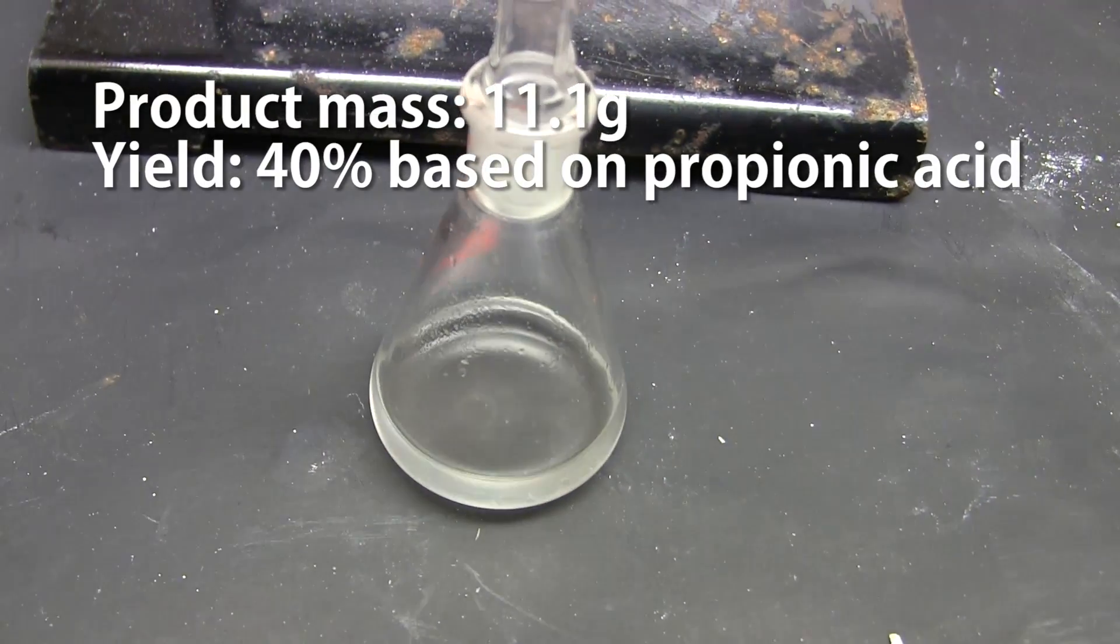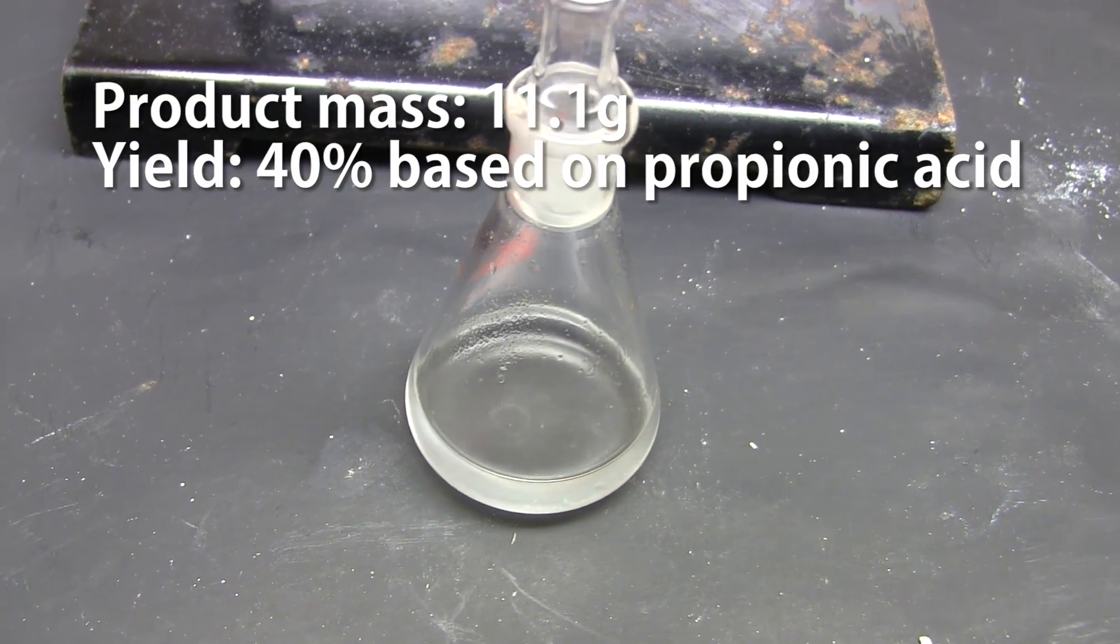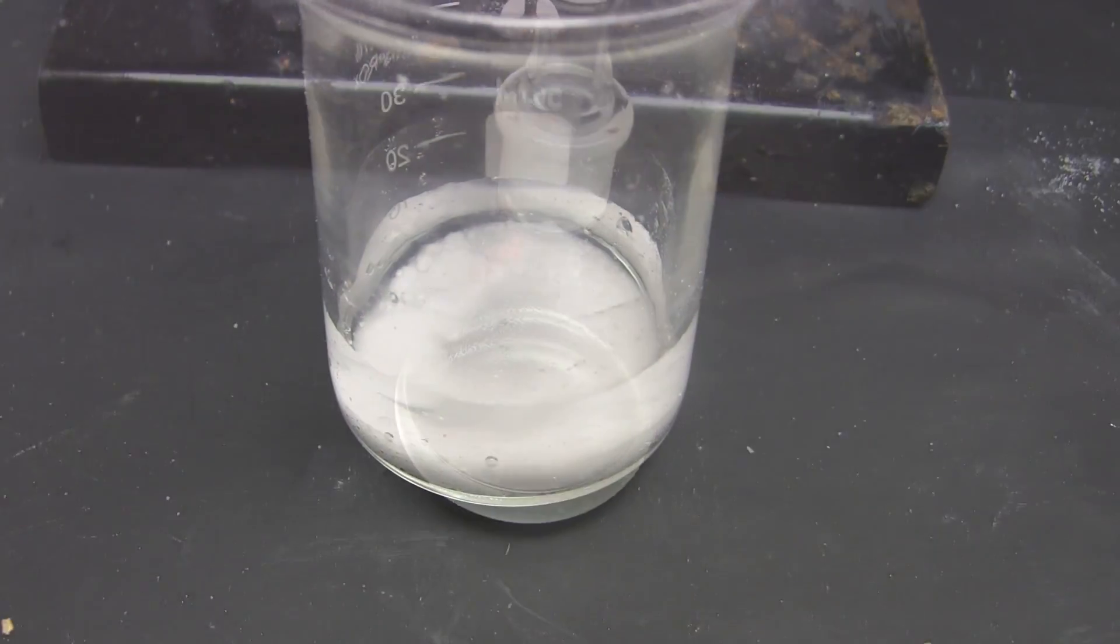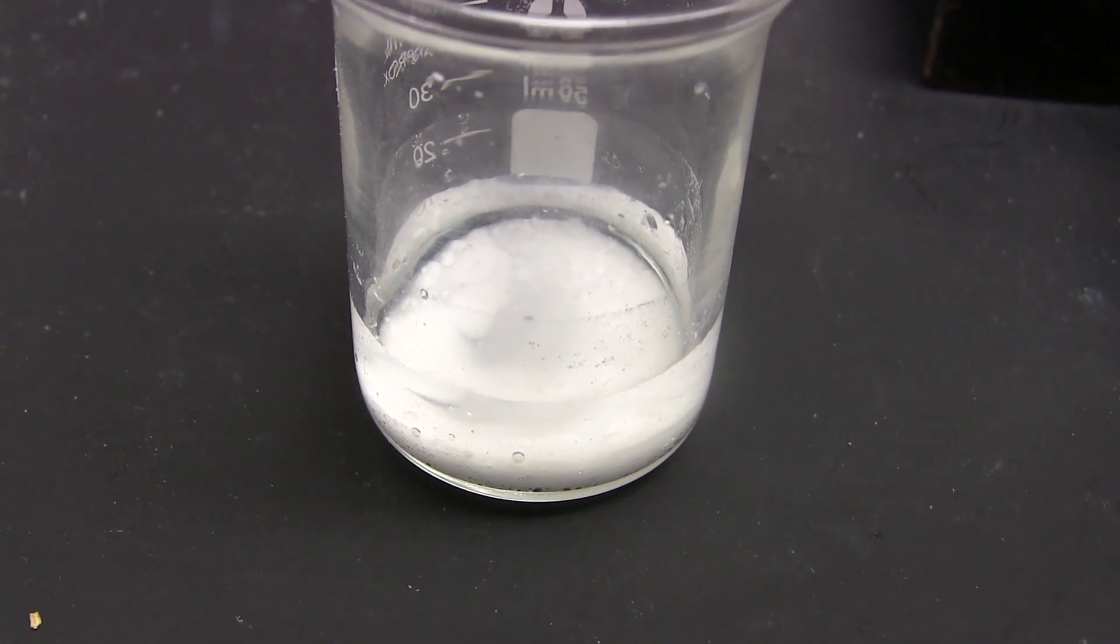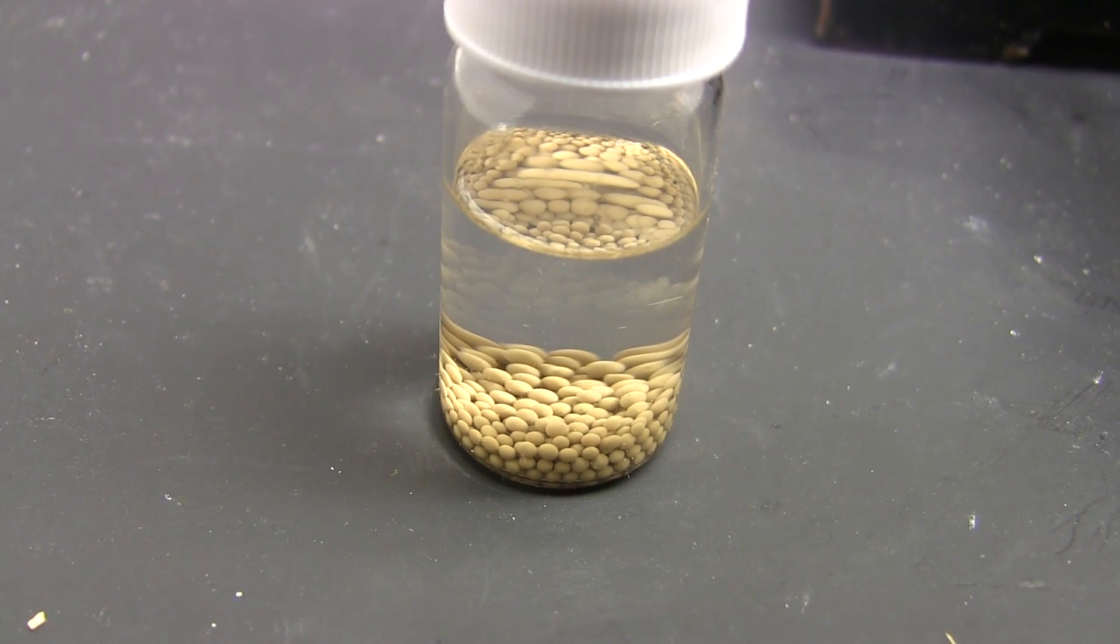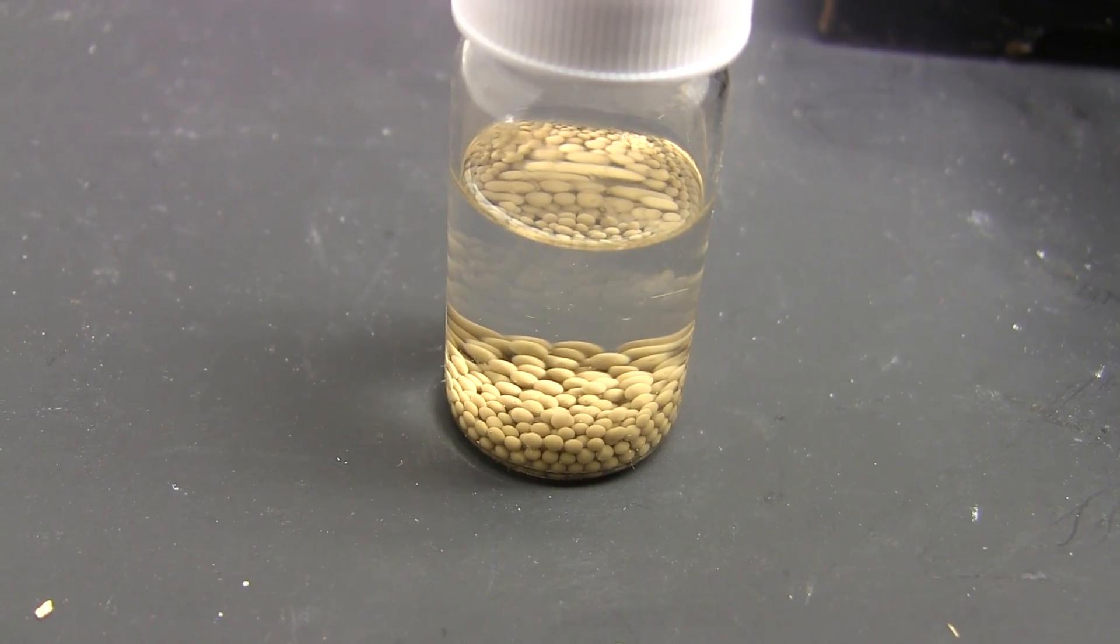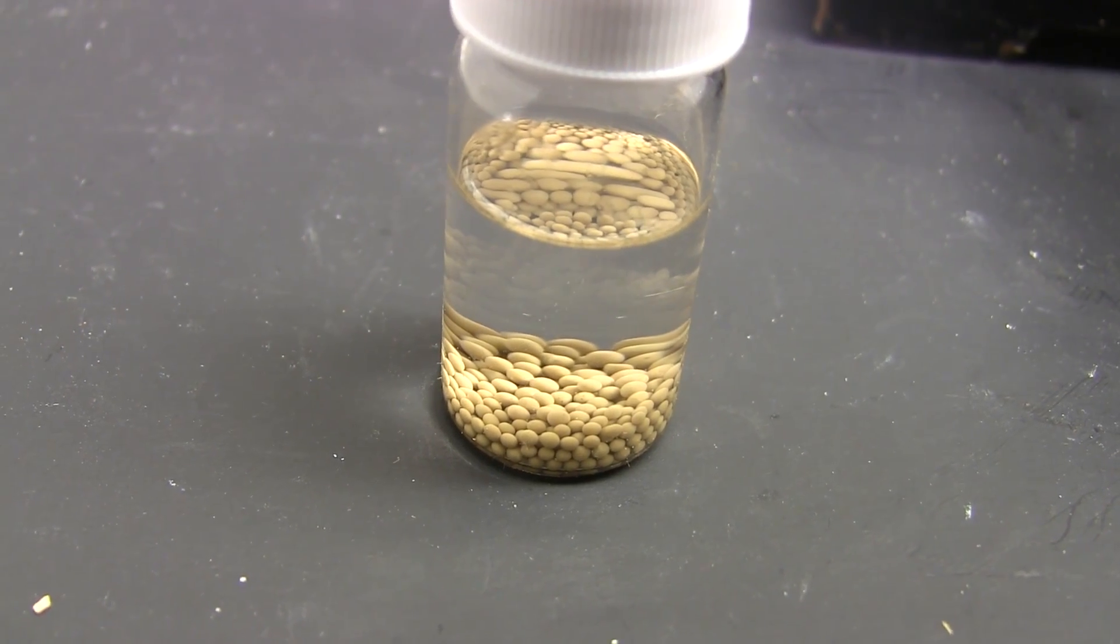The mass is about 11.1 grams so my raw yield was about 40%. For further purification we can dry it over some sodium sulfate and then fractionally distill, finally drying over molecular sieves. Now esters are known for their smells and this ethylpropionate is no exception. It has a rather sweet, fruity smell.